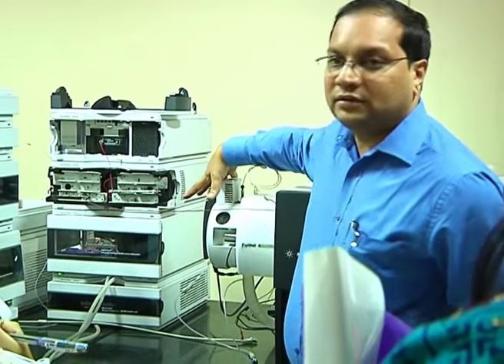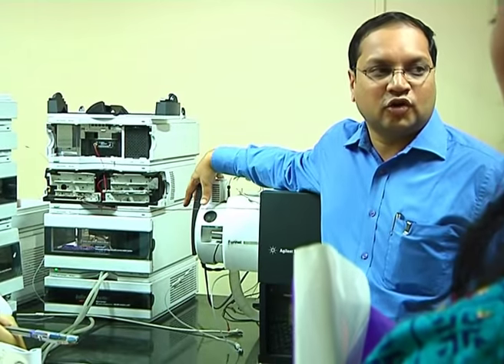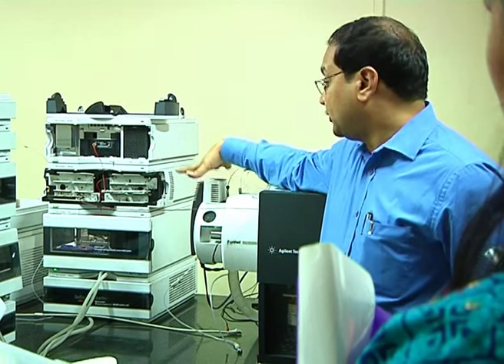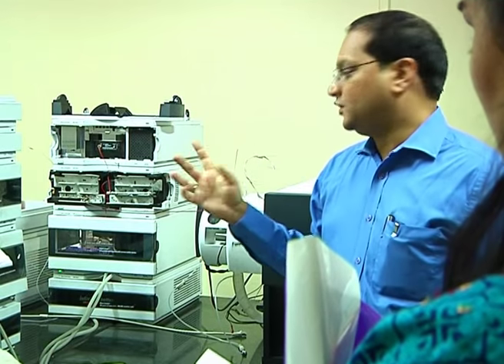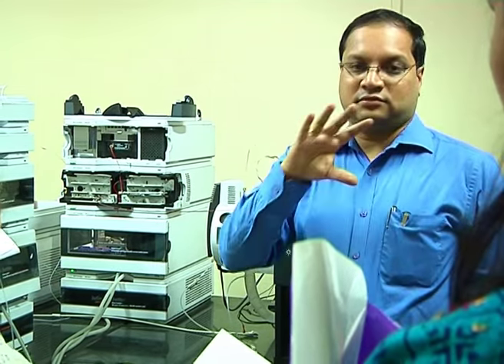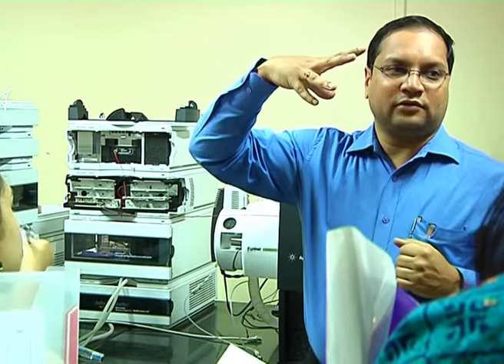That is the role of an interface, also called the ion source or atmospheric pressure ionization technique, and one type of atmospheric pressure ionization is electrospray ionization, which is this. Electrospray ionization, also properly called pneumatically assisted electrospray.